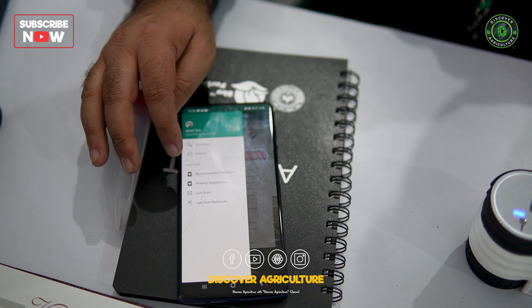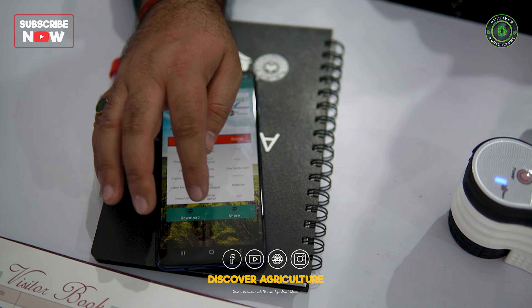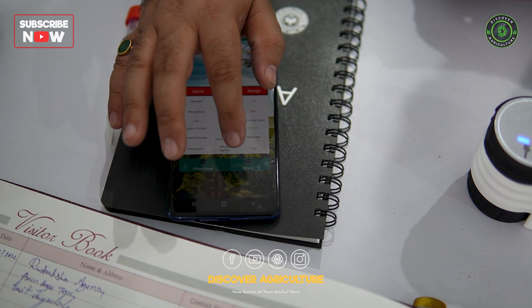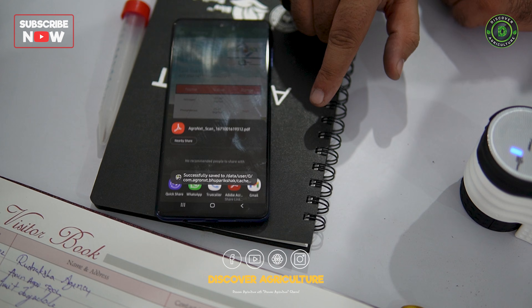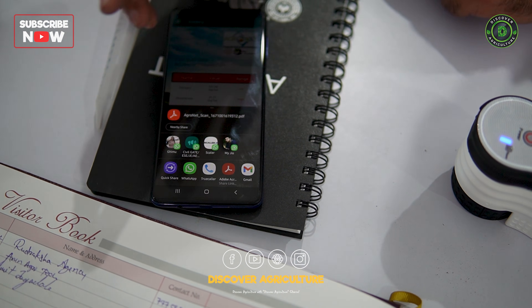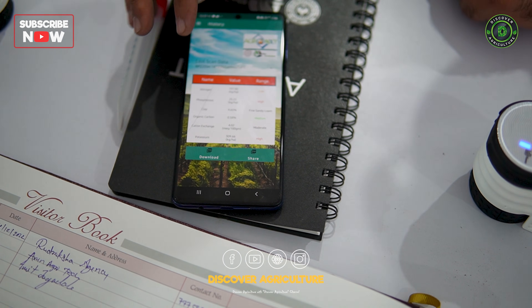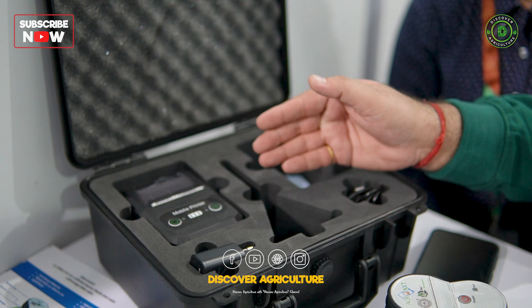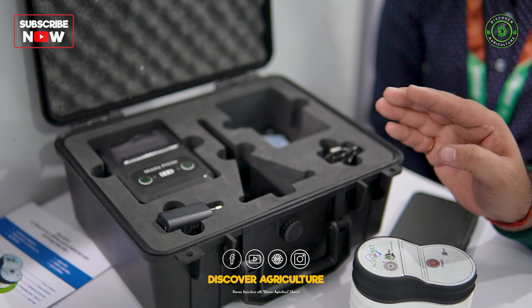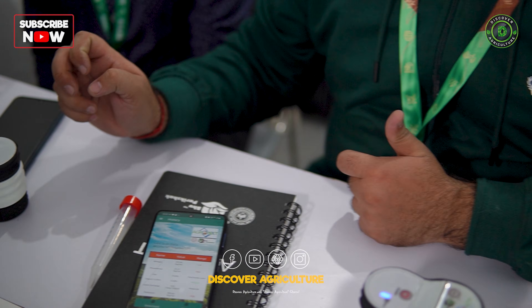If you click on the history tab you'll find two options: download and share. You can share a soft copy of the report over WhatsApp, email, or any other platform. If you wish to take a hard copy, the Moo Pariksha kit includes a thermal mobile printer, which allows you to print the diagnosis report and the tailor-made recommendations as well. Thank you very much.